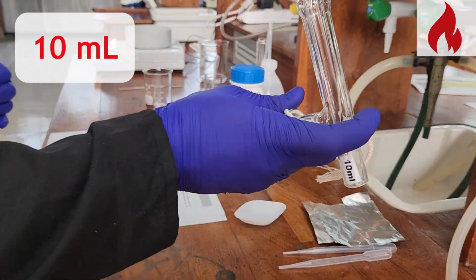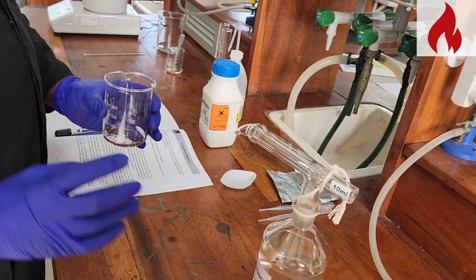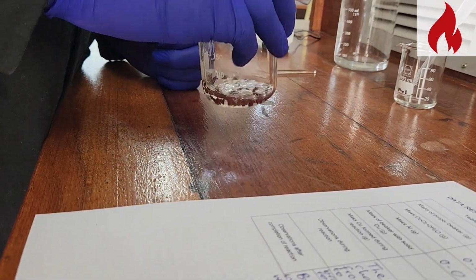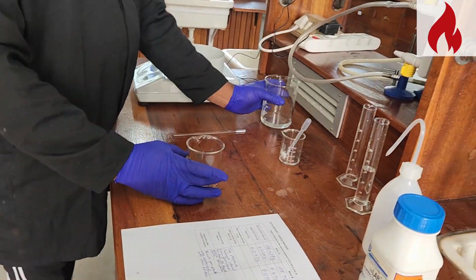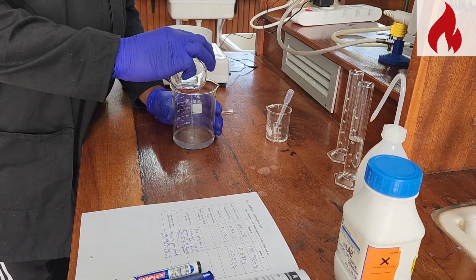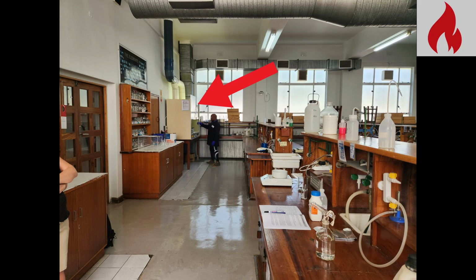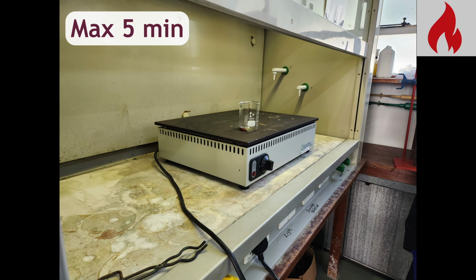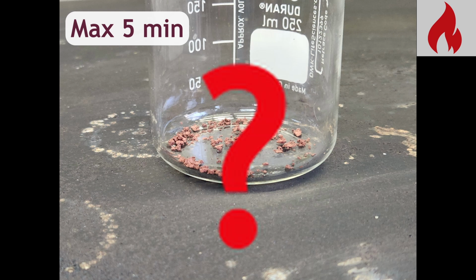Wash the copper solid with approximately 10 cubic centimeters of methanol. Let the solid settle and decant the solution from each beaker into the 600 cubic centimeter glass beaker. Mark each beaker with your initials and place them on the hot plate in the nearest fume hood for 2 to 5 minutes until the copper solid is dry. Avoid heating for more than 5 minutes as this may cause unwanted oxidation of the copper. Do you have any idea of why oxidation of the copper would be problematic for your experiment?